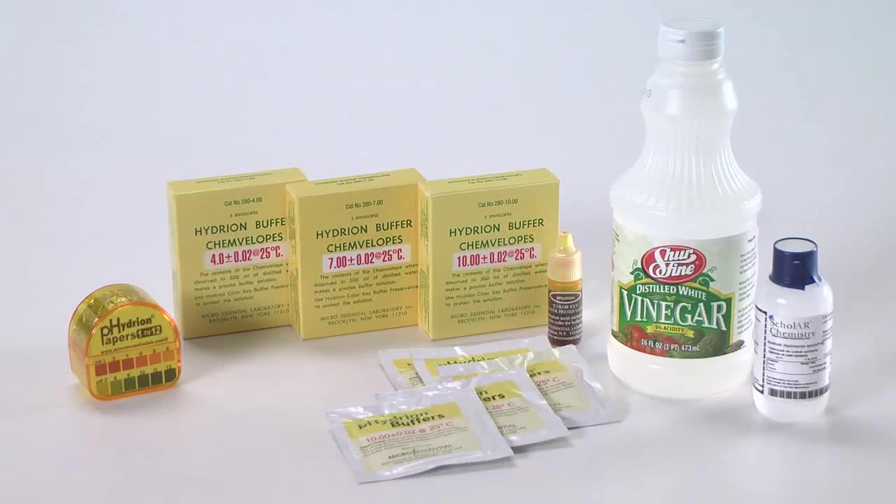The pH of systems can be controlled and tested using the sodium hydroxide quick prep solution, the acetic acid or vinegar solution, the buffer solutions available for pH 4, pH 7, and pH 10, and the pH test paper.